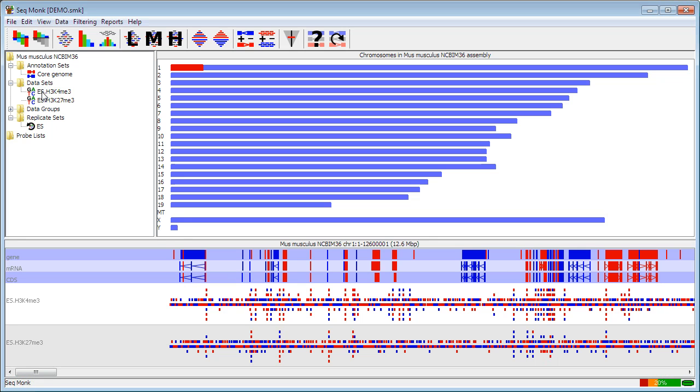I can also see the data sets which are individual data files that have been imported into the program. I have the two files that I imported earlier. If I had any data groups they would appear in the data groups folder which are combined technical replicates. And the replicate sets are biological replicates where I can define groups which are from the same biological condition.